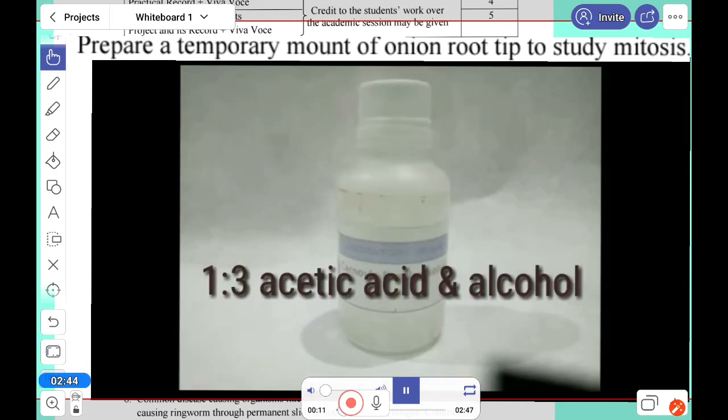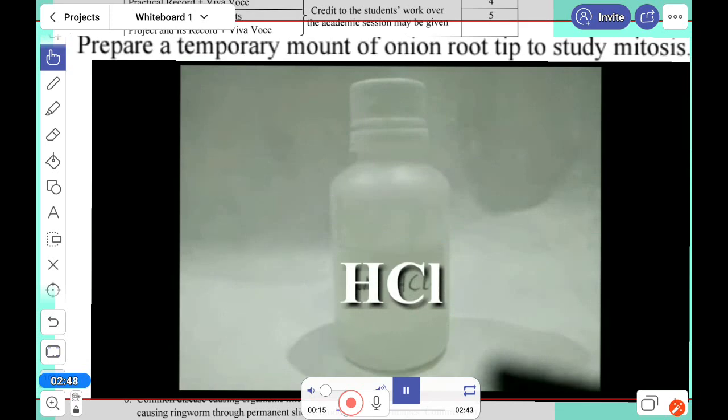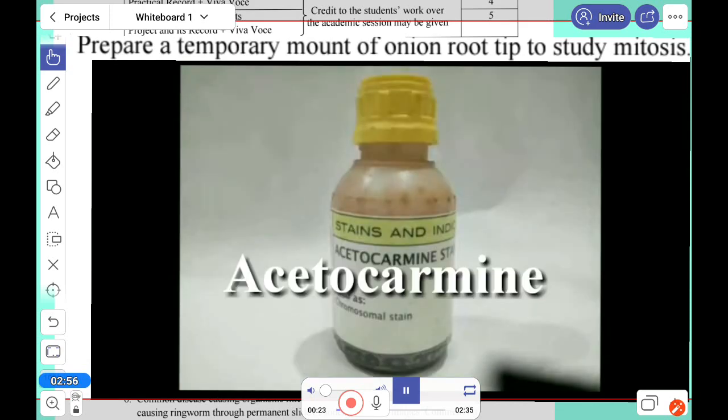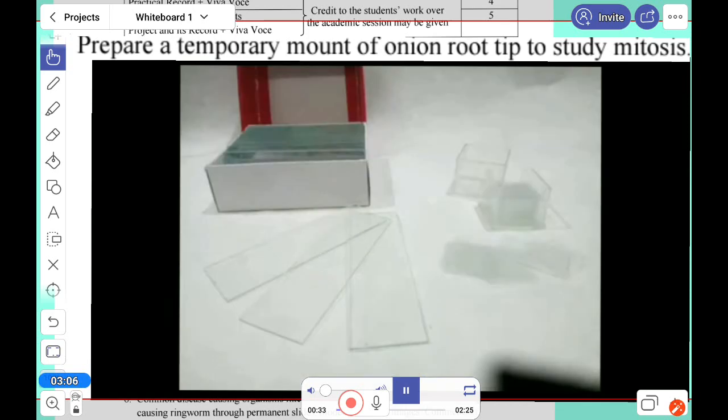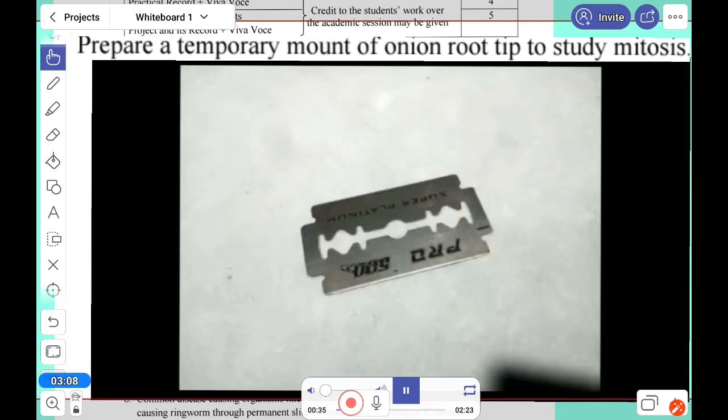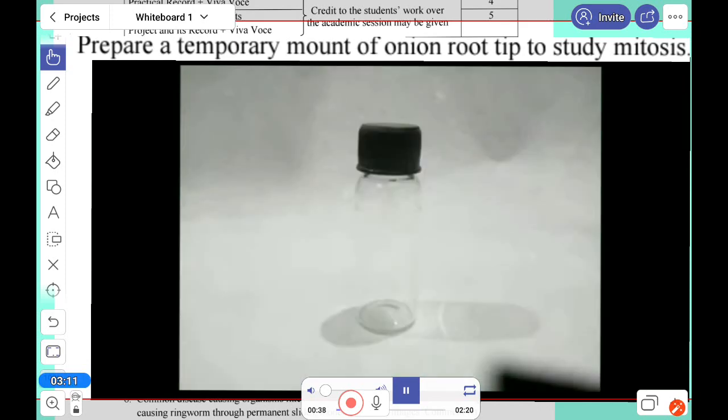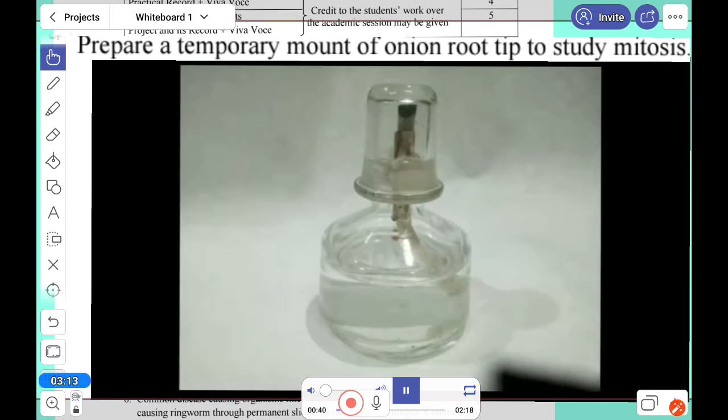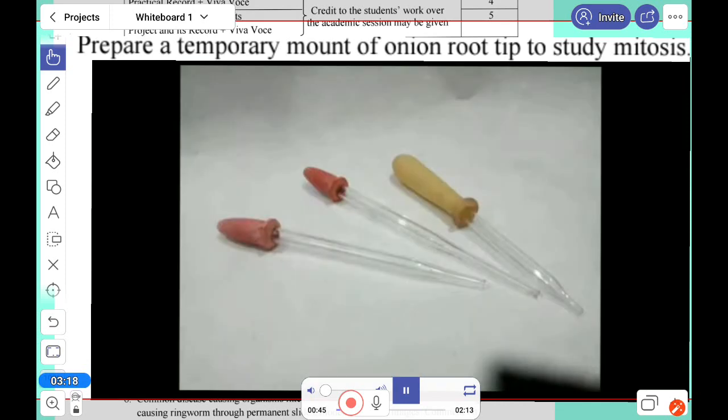We have to take acetic acid and alcohol, one is to three, that combination. Hydrochloric acid for softening the plant part and cells. Aceto-carmine, the stain which can stain the chromosomes so that the chromosomes will be prominent from the cellular different parts. Slides, coverslip required, one blade is required, watch glass, empty vial, and spirit lamp.